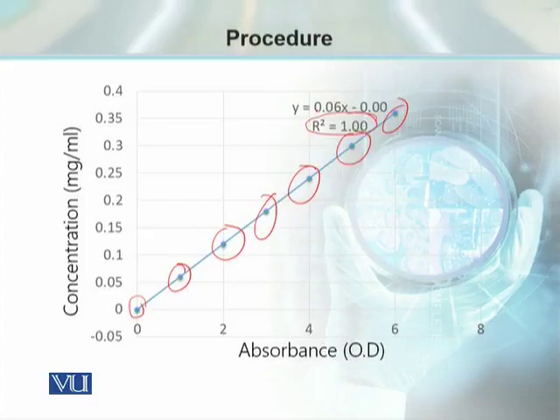अब हमारे पास दो किस्म के स्पेक्ट्रोफोटोमीटर्स इस वक्त एग्जिस्ट करते हैं, एक बेसिक स्पेक्ट्रोफोटोमीटर और एक लेटेस्ट स्पेक्ट्रोफोटोमीटर जिसमें हमने कंप्यूटराइज़ सेटअप और इंस्टॉलेशन कर दी है. In those systems we can make this standard curve once, and then we can use this standard curve as a reference every time we want to see the concentration of proteins.